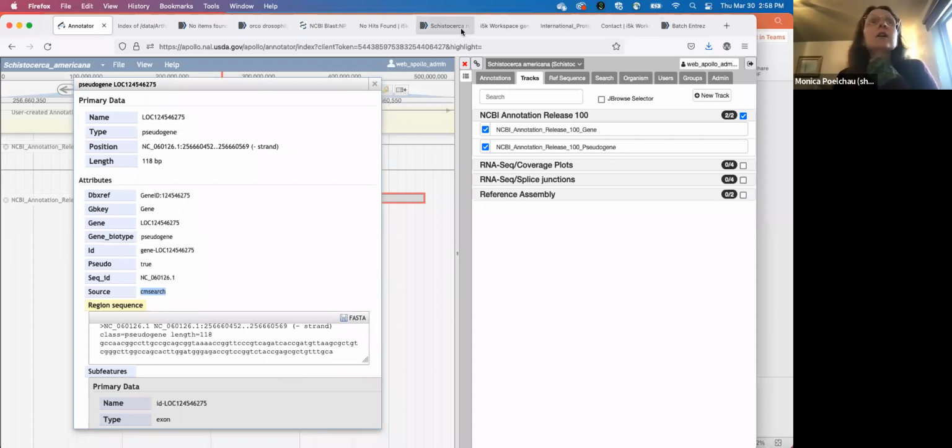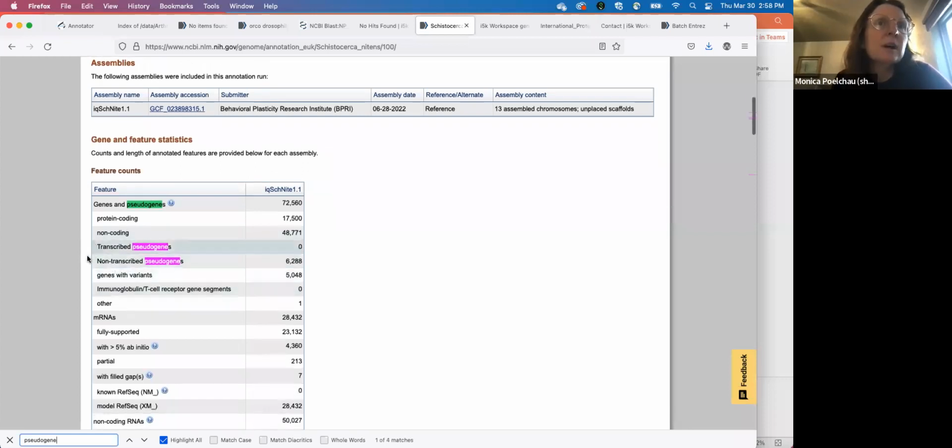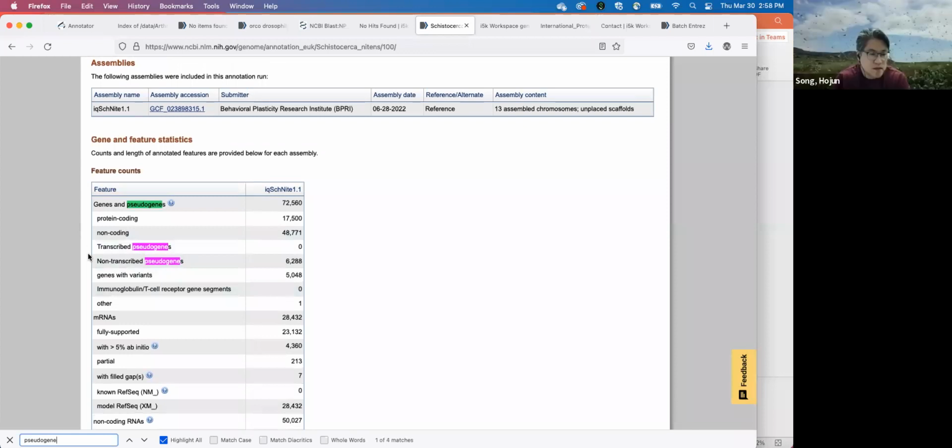They give you a breakdown of the type of pseudogene in that sense. With pseudogenes, without additional functional information or annotators going in, it's kind of hard to know what type it is. It could be that the genome sequence is poorly predicted, and therefore it's actually just a broken gene model, truncated at the beginning of the sequence. I see. So is it a pseudogene because it is partially transcribed, that kind of thing?